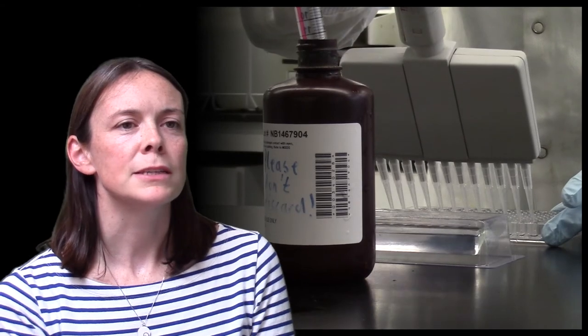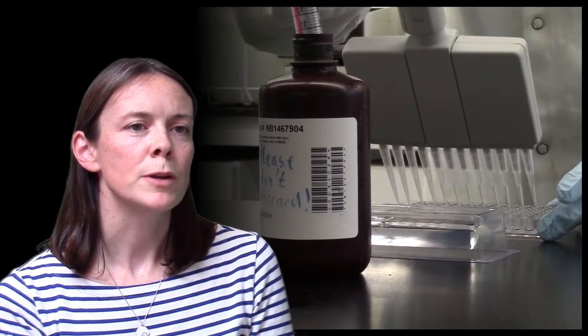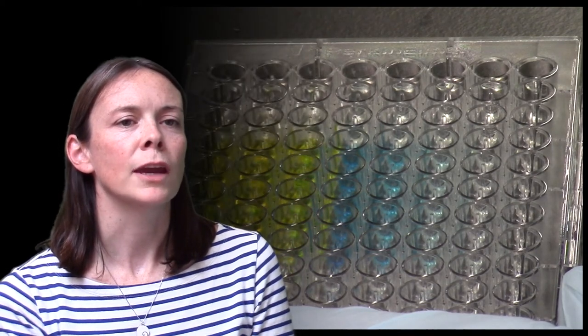Finally, the HRP is detected with addition of the TMB ELISA substrate which over a 10 minute period develops from a clear liquid into a blue solution. To stop the reaction, sulfuric acid stop solution is added producing a yellow liquid for quantification.